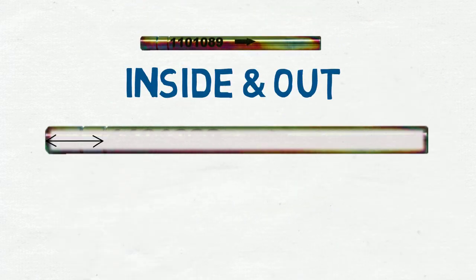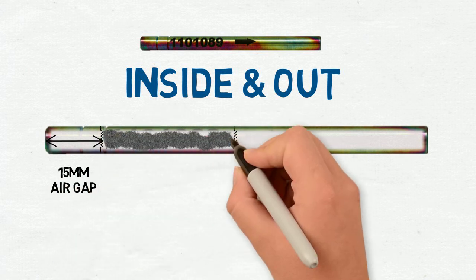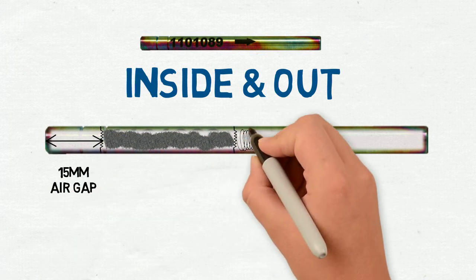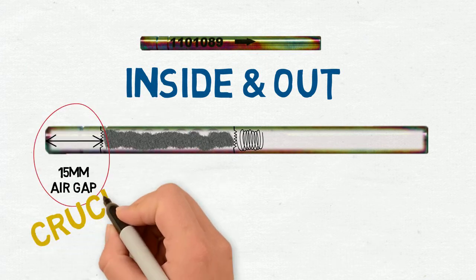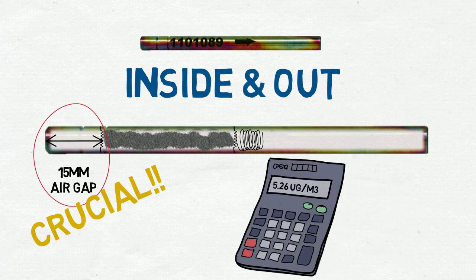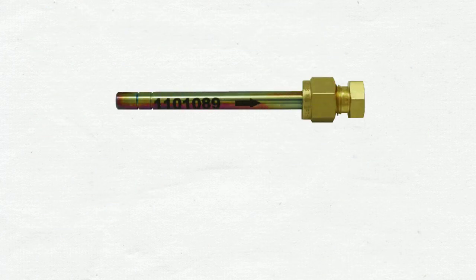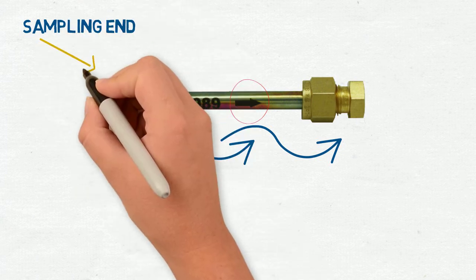Inside the tube there is a 15mm air gap, wire mesh, sorbent, more wire mesh, and a G-clip to hold the sorbent in place. The 15mm air gap is at the sampling end of the tube and is crucial because all calculations are based off this number. On the outside of the tube there is an arrow which indicates air flow and points away from the sampling end.